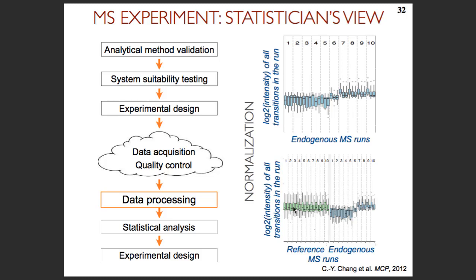And so we see now that the reference peptides, they were supposed to be at as constant a concentration as possible, right? Because they have no biology in them. They're reference standards. They're all spiked in at constant concentration. And those boxes, they're a lot more stable than these boxes, right? So already this tells us that probably some of this change is biology.